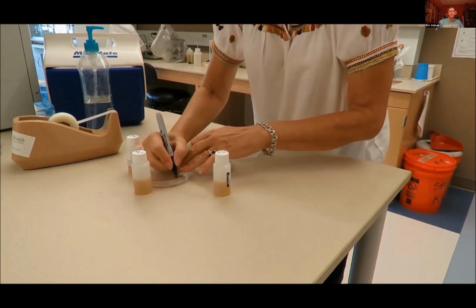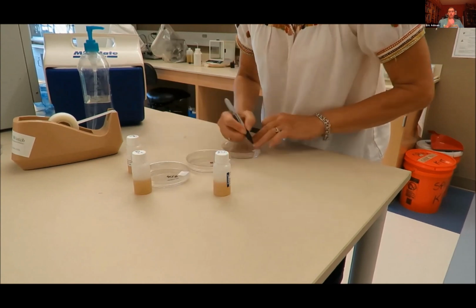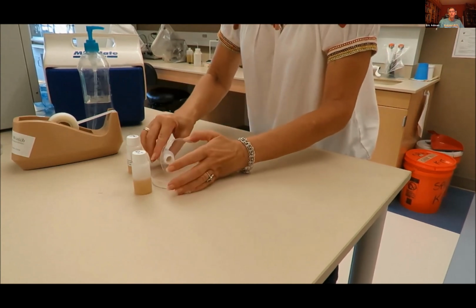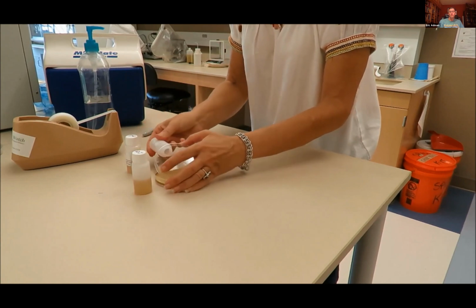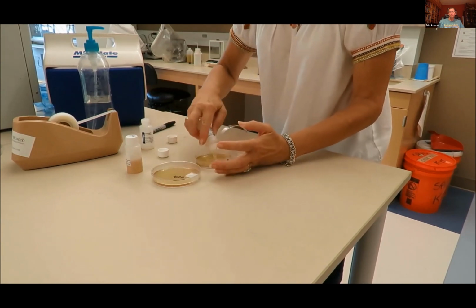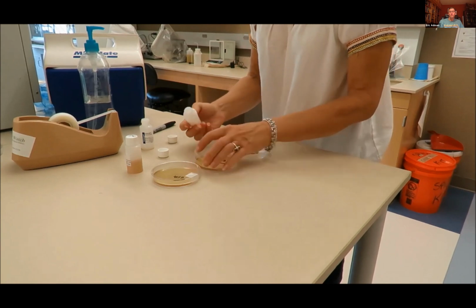Label the plate lids with labels that correspond to the inoculated media bottles in the data form. Lift the top of the petri dish just enough to pour the contents of its corresponding media bottle into the plate. Do not slosh the media onto the sides or lid of the plate. Record the time you plated your sample on your data form next to incubation start time.